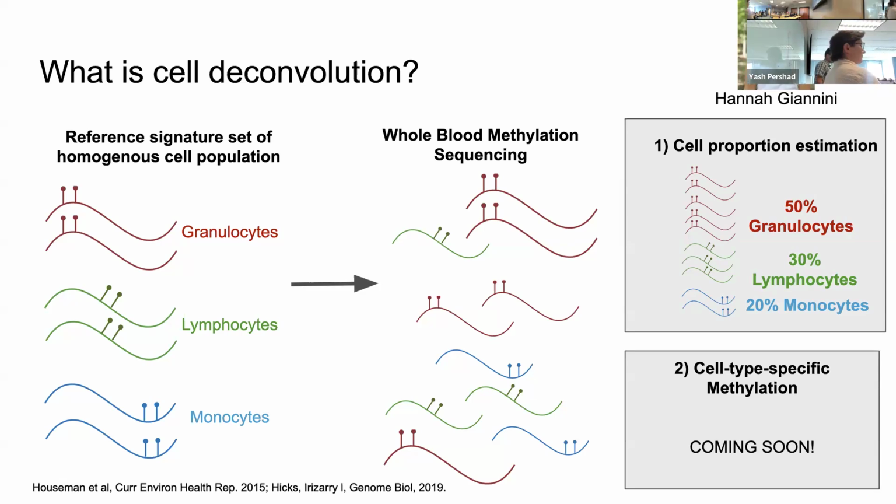So I would caution against using it specifically, but it can be useful if you really care about a specific cell type, and you could pair it with data where you have flow sorted it, so you could validate what you found. But either way, number one is what we really need to do epigenome-wide association studies. So we'll focus on that.